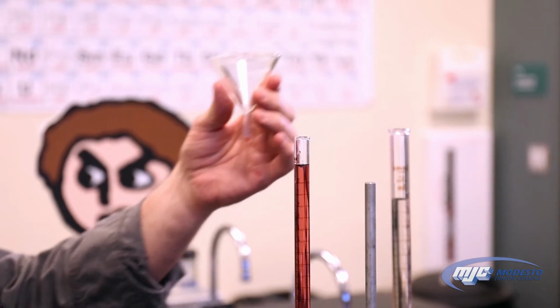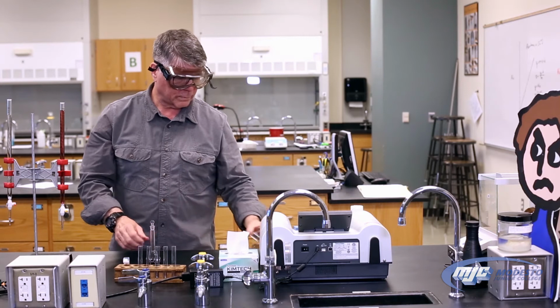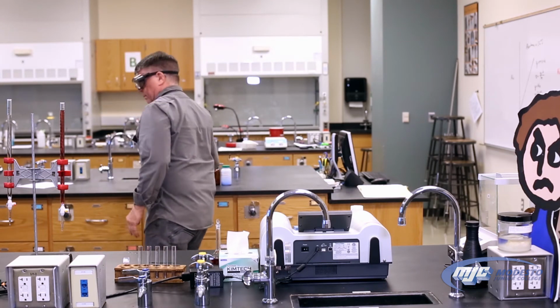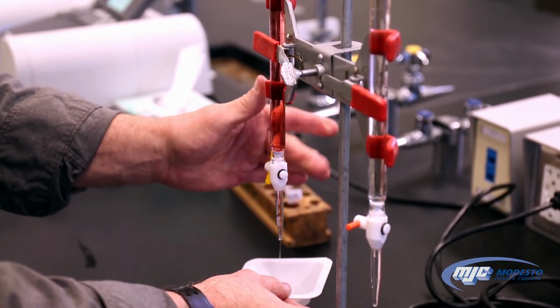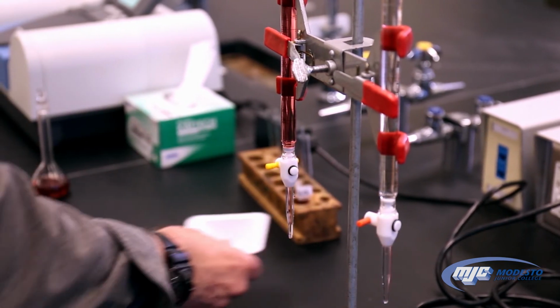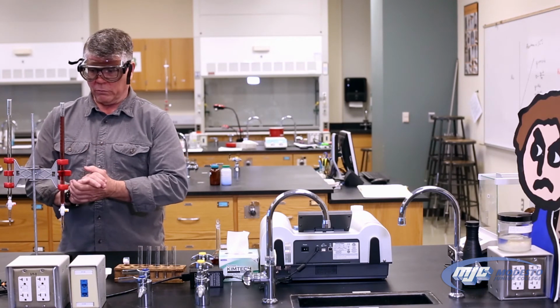There we go. That's pretty good. Drain a little bit, the air bubbles out. That's good. All right. So now I have my water, I have my stock solution.